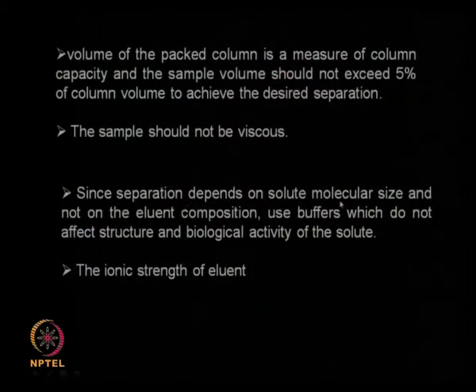Separation depends on solute molecular size and not on the eluent composition. You can use buffers which do not affect structure and biological activity of the solute, that is very important. So if I have to use buffers, I should see that the buffer does not affect the structure and the activity of the solute, because the whole concept of size exclusion chromatography is based on shape and size.